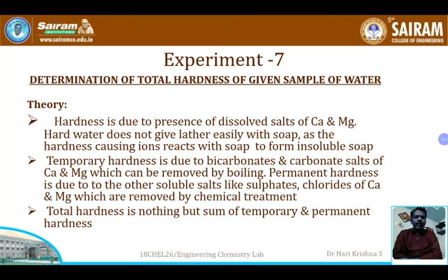Good morning. We have come to the second part of our experiments, that is volumetric estimation. I completed the instrumentation. In volumetric estimation, the first experiment is determination of total hardness of a given sample of water.